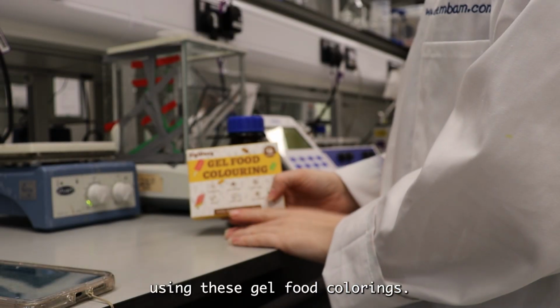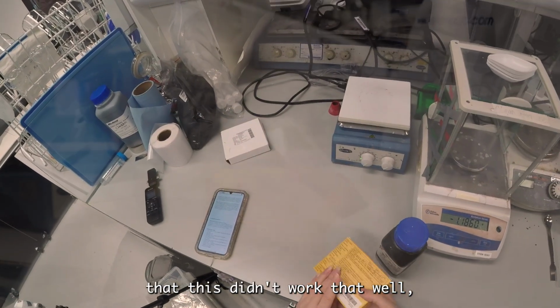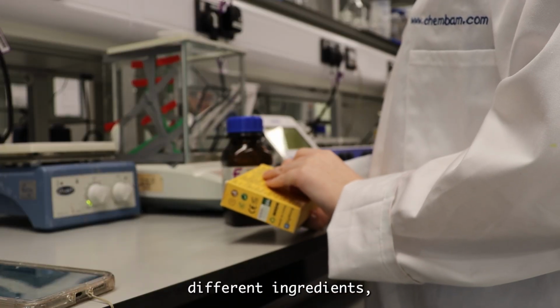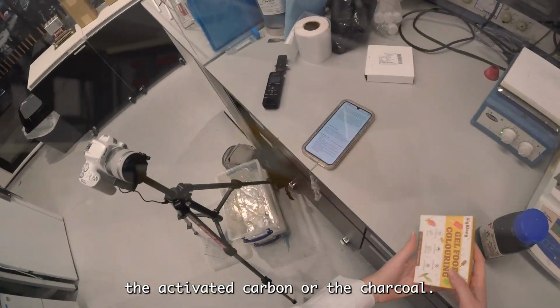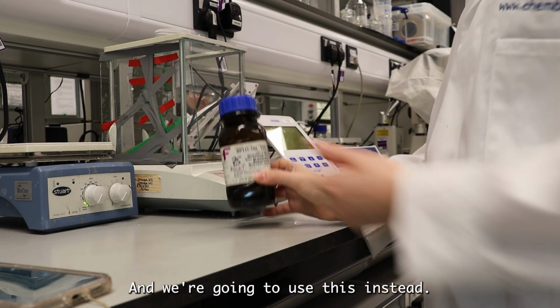Okay, so I previously tried it using these gel food colourings. However, I'm going to save you the time and say that this didn't work that well. So you'll have to try different types of food colouring that contains different ingredients, because this may block the carbon pores in either the activated carbon or the charcoal. So instead, I found some of the methylene blue in the cupboard and we're going to use this instead.